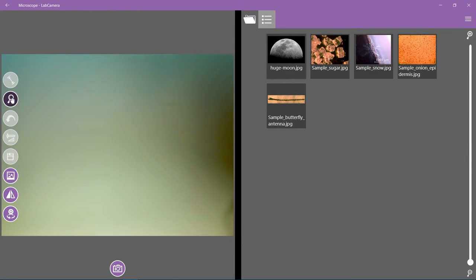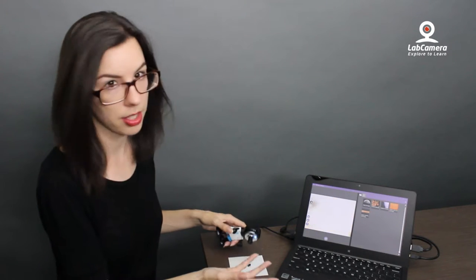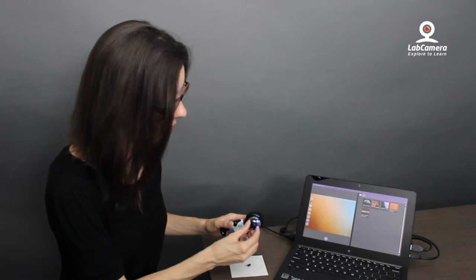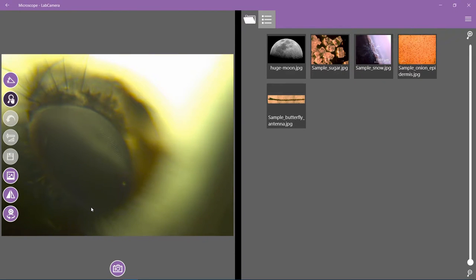What you see now is just this piece of paper on the table, but if I put this fly a little closer, then you see this big stain, which means I have to set the focus. And try again. Of course, I have to play a little bit with it to get a better view.